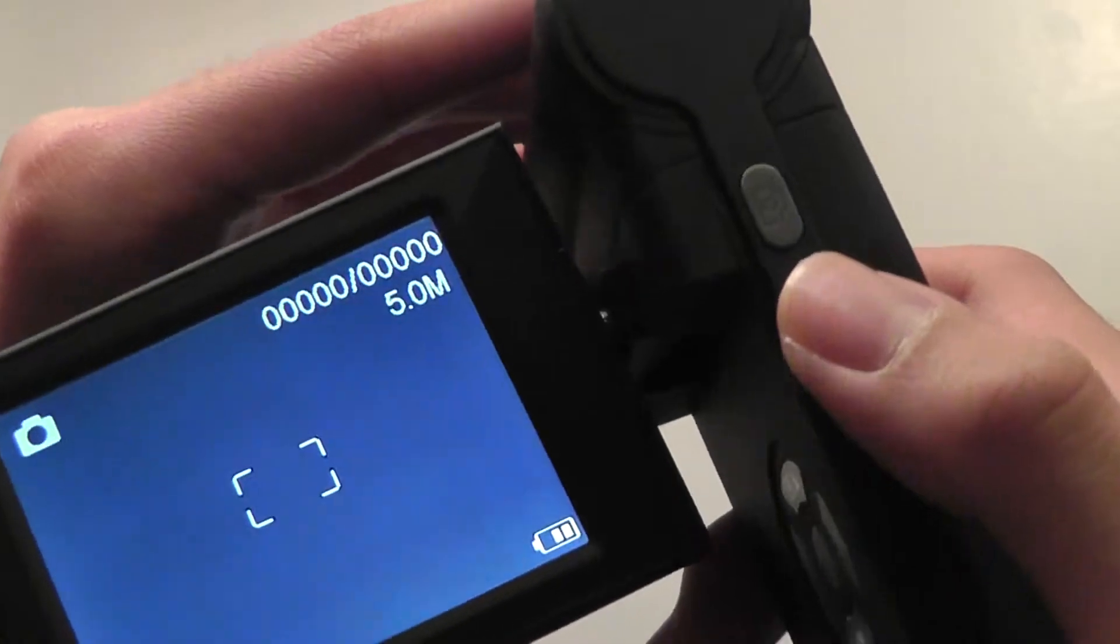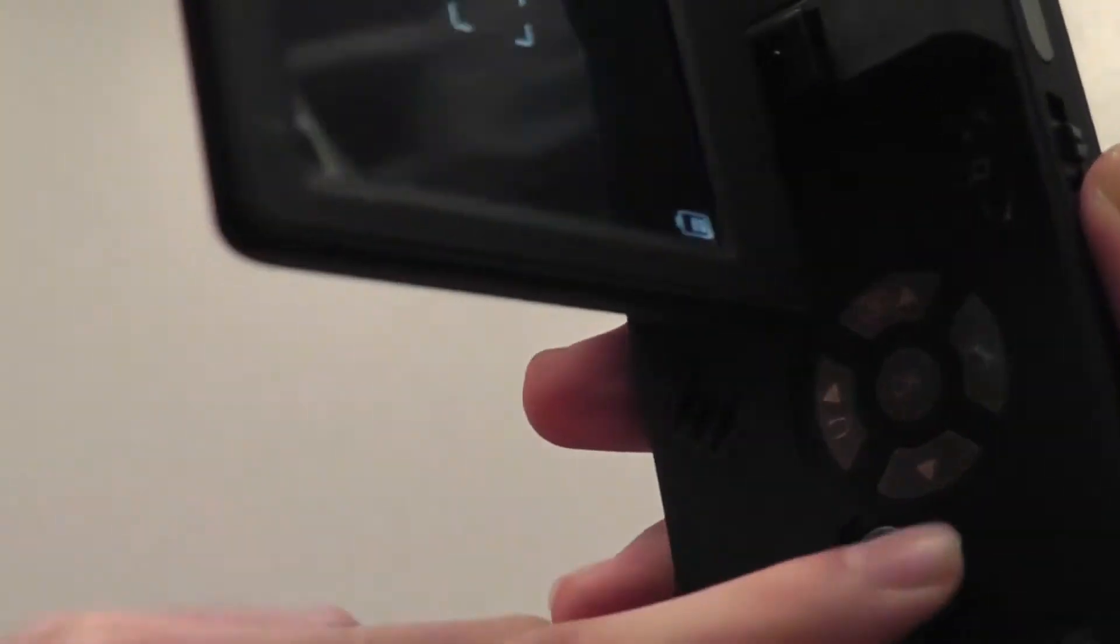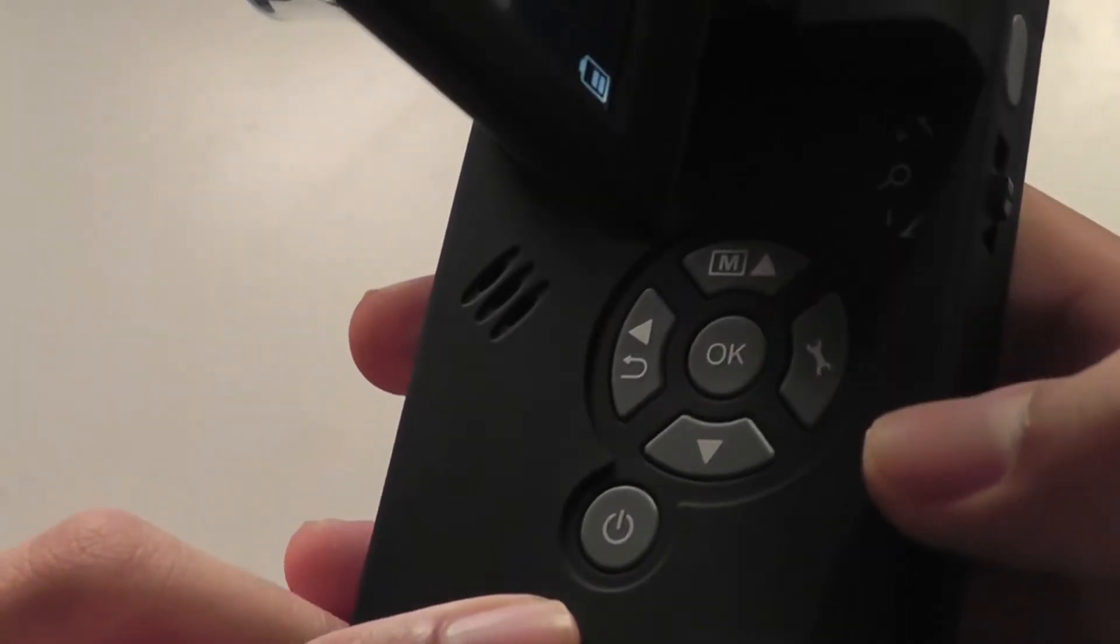The adjustments and ergonomics of the button controls is also pretty nicely spaced. We have access to all the controls from the zooming to the icons for the selection keys without having too much stretching of our fingers, which is good.